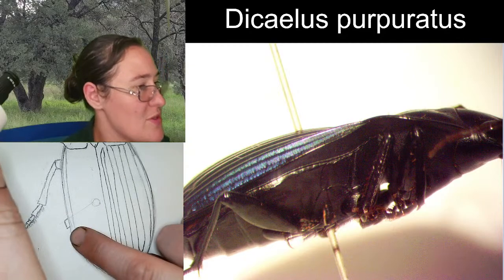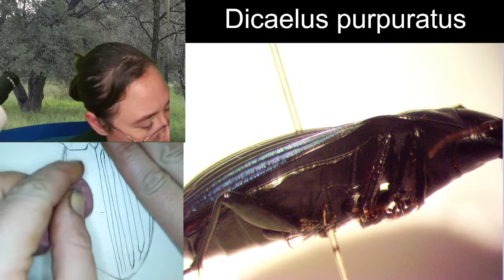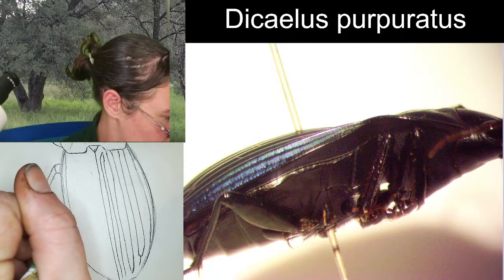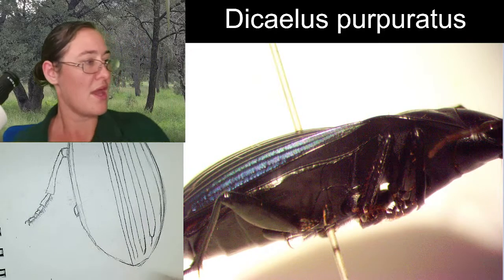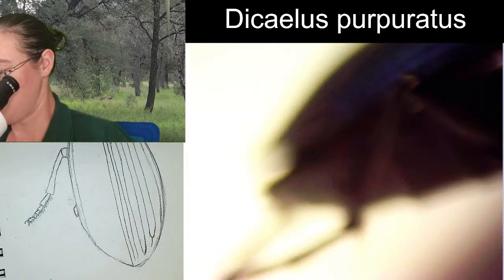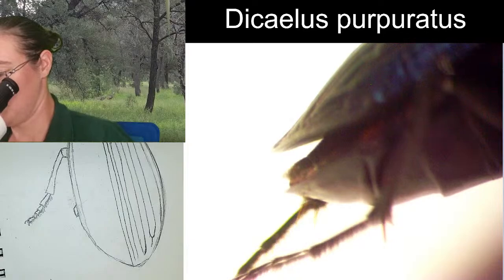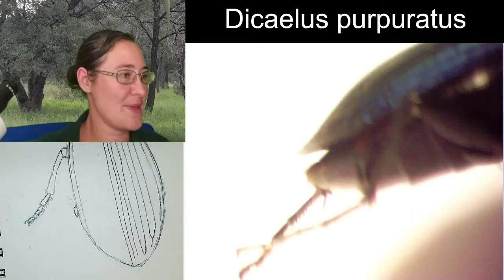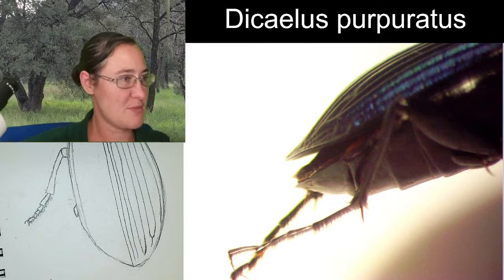Alright, so this femur is coming out right around here. It is angled backwards. And then we are going to have the tibia and the tarsal segments. The hind tibia has two tibial spines.